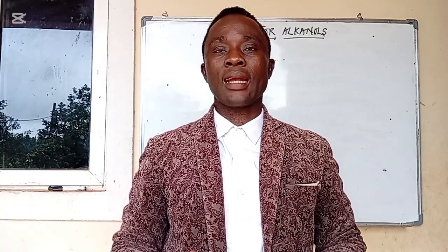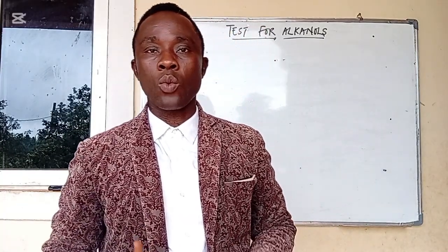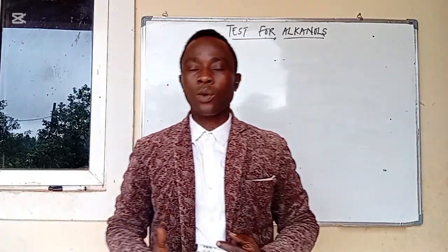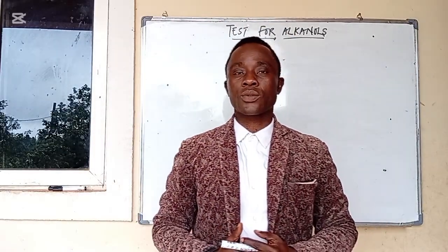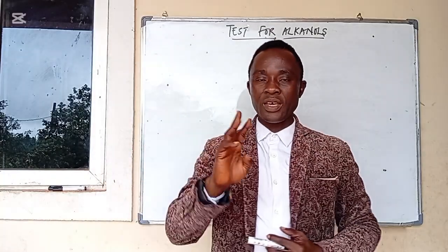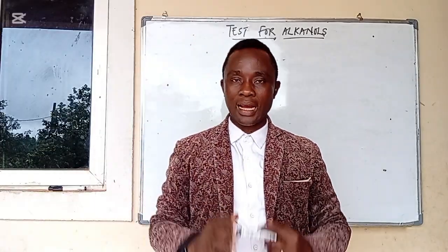Okay, in my class today, I will be discussing tests for alkanols. We have different types of alkanols: the primary alkanols, the secondary and tertiary alkanols. Now, in this test, I'll be giving you three tests that will differentiate the different types of alkanols.